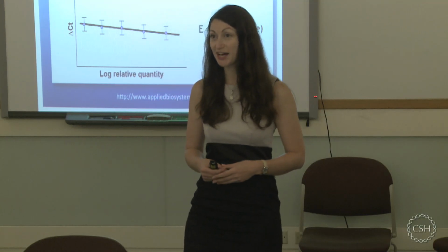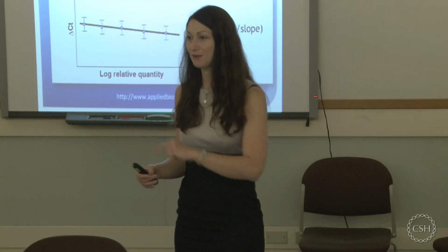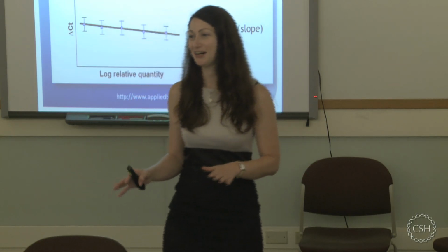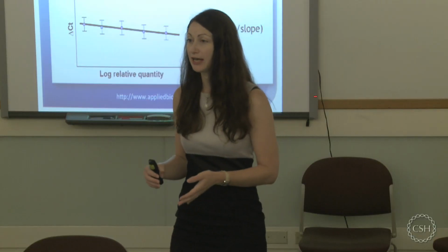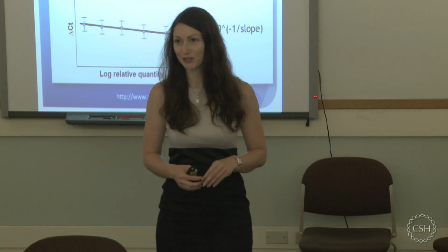Actually, yeah. In my entire PhD, that's what I did. I optimized every single one of my primers to the optimal TM and just used this TM in the future, because then you have maybe 95% in one case, but 100% if you just increase the temperature by a degree. I'm not saying everyone has to do that, of course. And then to get your efficiencies, how many dilutions and how many replicates do you run? Usually a dilution of 10 samples is what I do, and in triplicates, as everything in qRT-PCR is always in triplicates, unless you have a very good reason why you can't use triplicates.